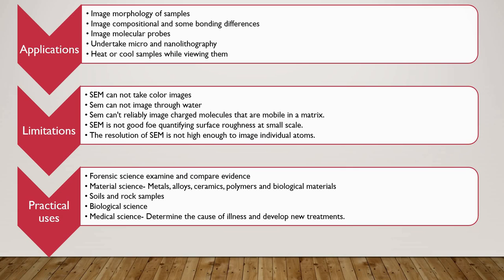Undertake micro and nanolithography, remove material from samples, cut pieces out or remove progressive slices from samples. Then heat or cool samples while viewing them. Then next is wet and dry samples while viewing them. View frozen material. Next is generate X-rays from samples for microanalysis.